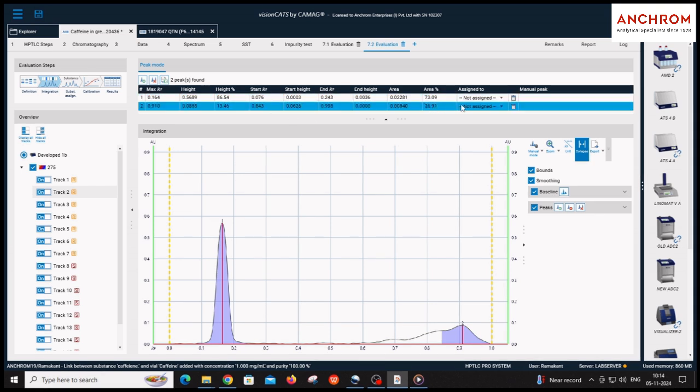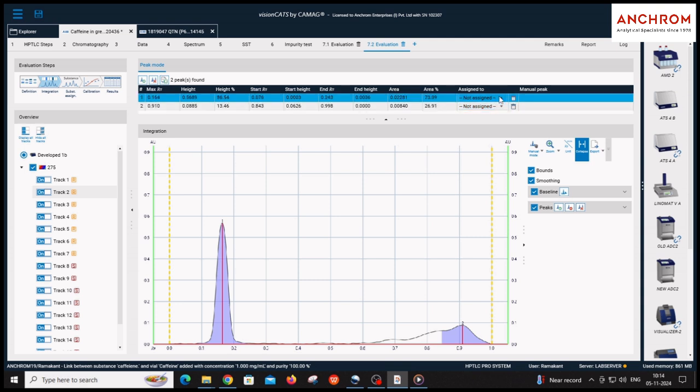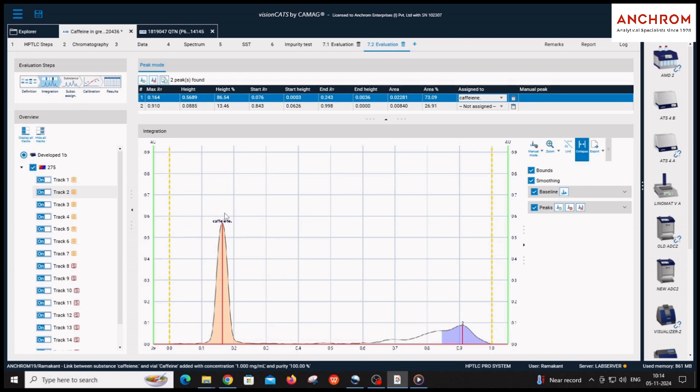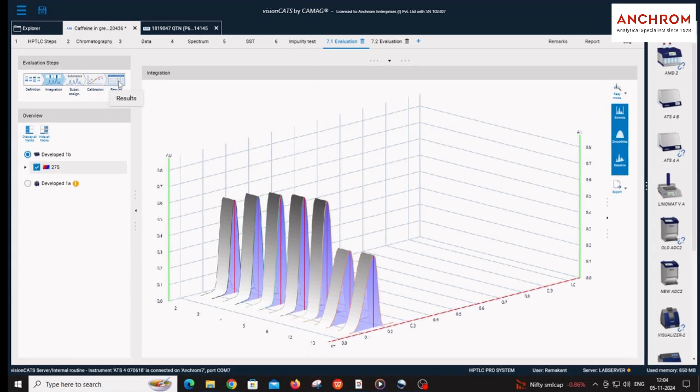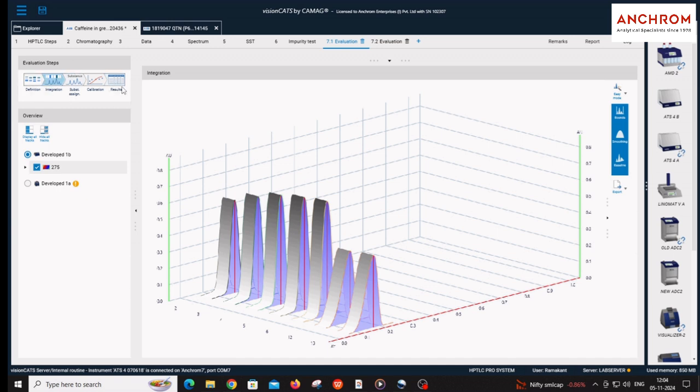For assigning names to separated peaks, click on assign to and select the appropriate names. Substance assignment, calibration, and result steps under evaluation steps are required for quantification.